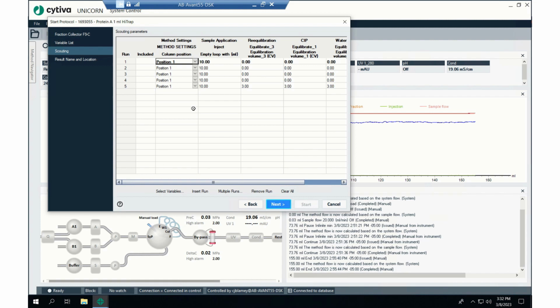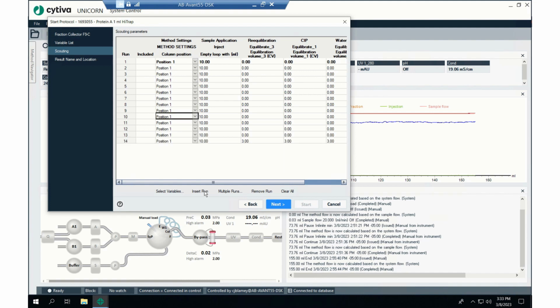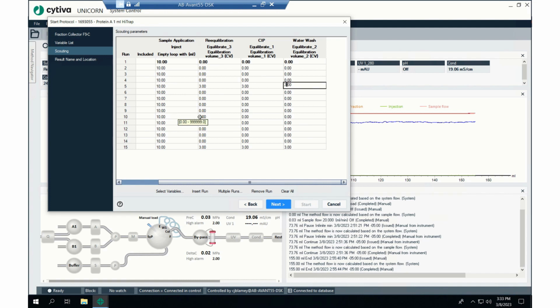All right, so when we wrote the scouting part of the method a little while ago, we only did 5 runs. That's because I wanted to show you that in the start protocol, you can also add runs here. So I'm going to insert one more run. I inserted it right here at position 1, so I'm just going to add a bunch of them until we get to position 15. There are now 15 rows and only the last one is CIP'd. So I'm going to do 5, 10, and 15 as the places I'm going to CIP. I'm just going to hit 3 in each of these positions.